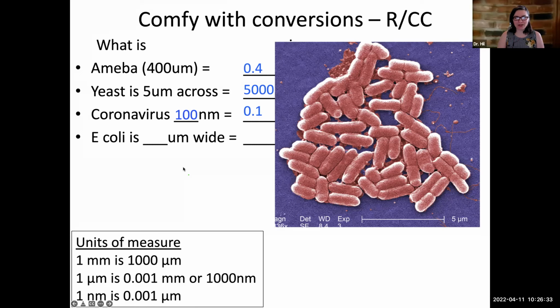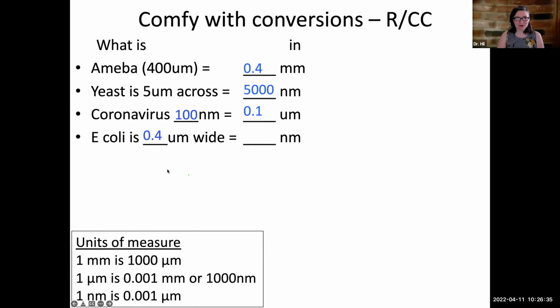So you and Erica are pretty much on the same page there. I agree with those. Now, this is the one I got. It is not important that this number is slightly different than the majority of people, who said 0.5. Some people said 0.4. Some people said other numbers. Some people said 0.7. But if that's how you did it, just using that scale bar as a gauge, then that's the right way to do it.